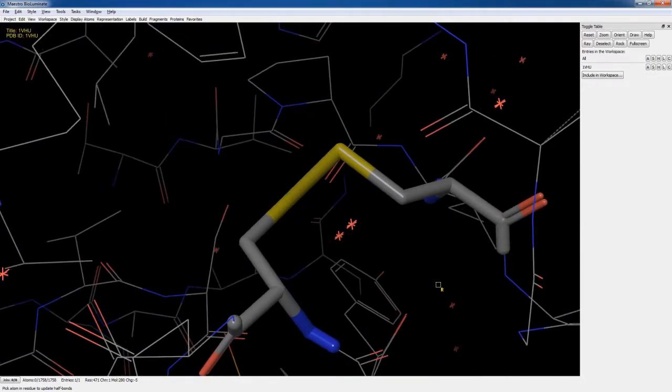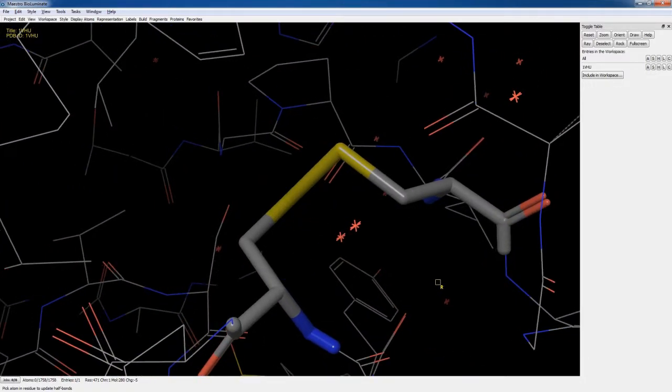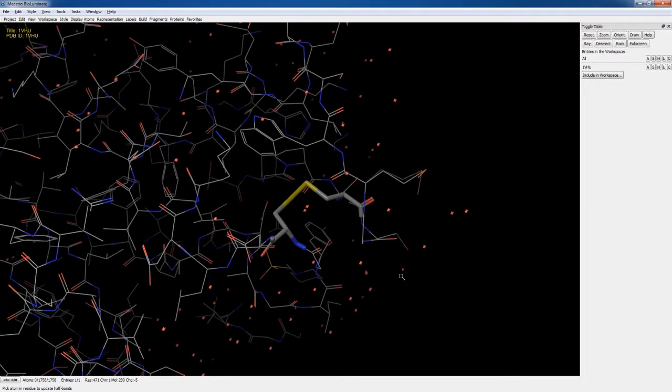In the first part of this exercise, we'll mutate these cysteines to alanine, and in the second half of the exercise, we'll run the cysteine mutation calculation in an attempt to repredict the cysteines and the true disulfide. This way, we'll be able to compare the predicted disulfide versus the disulfide from the X-ray crystal structure.